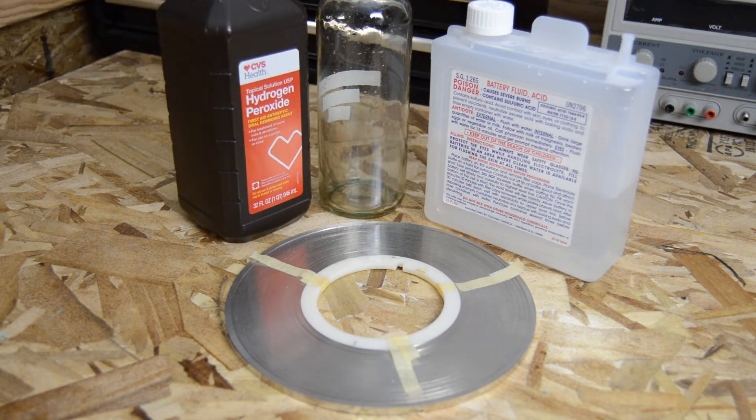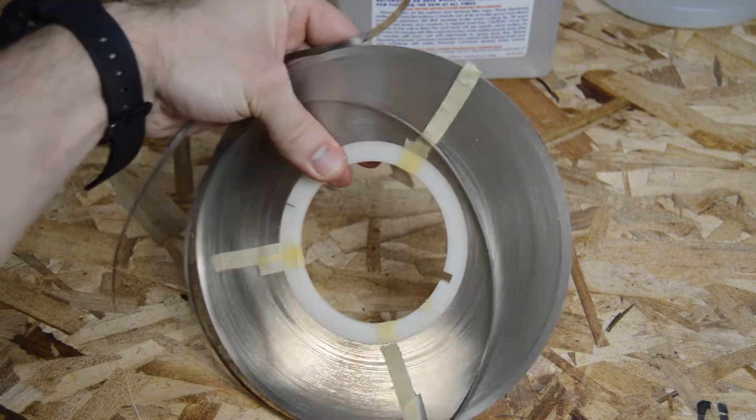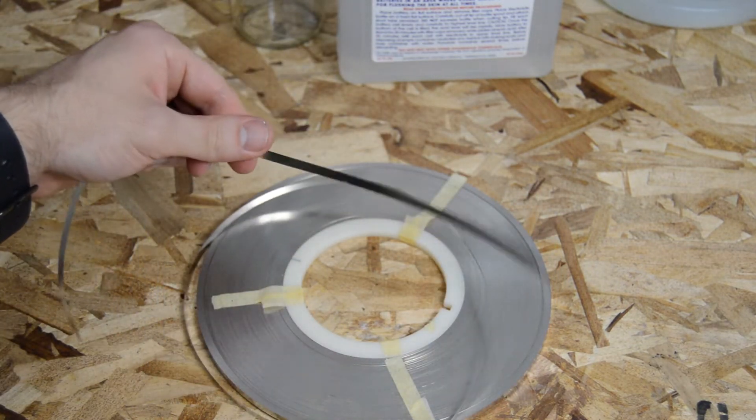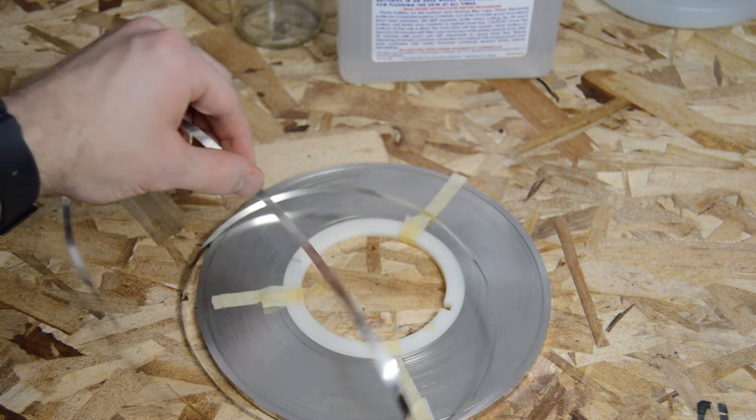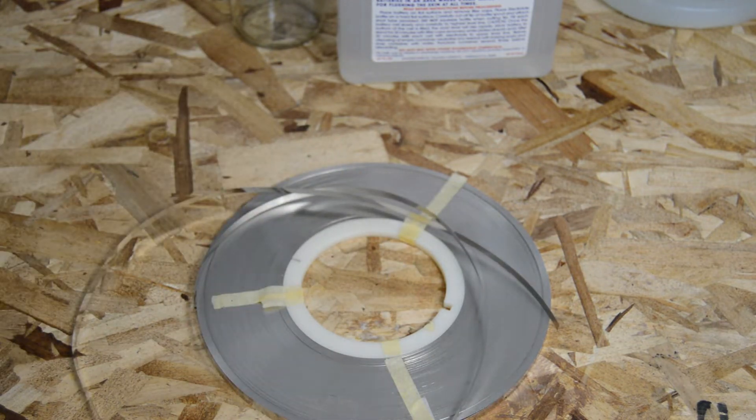I'll be using nickel metal strip made for creating rechargeable battery packs. This nickel strip is usually tack welded to join rechargeable batteries together to create battery packs. It's also 99.6% nickel so it's very well suited for this project since pure nickel is actually a little hard to come by at a reasonable price.